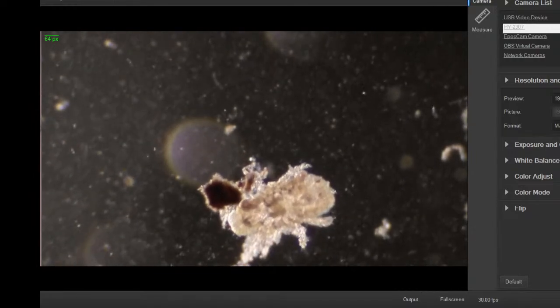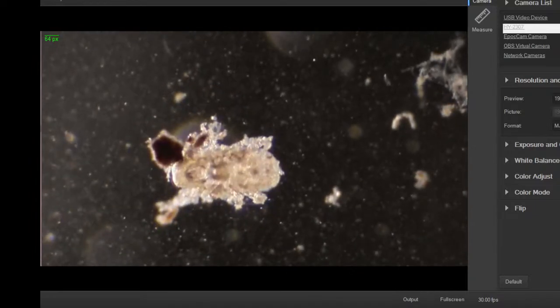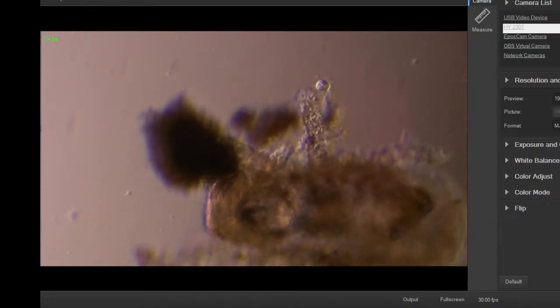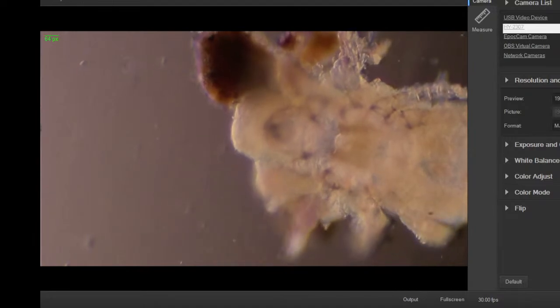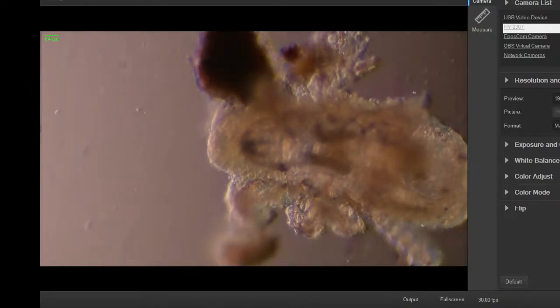Swimming around the mite. It's pretty wild. Try to get a little bit closer here. I can just barely do it without a cover slip. I'm going to have a little more free swimming. Once I put a cover slip on, it's more restricted motion. With backlighting, you can see through its structure some different colors there. And I'll turn down the backlighting a little bit here, the contrast.